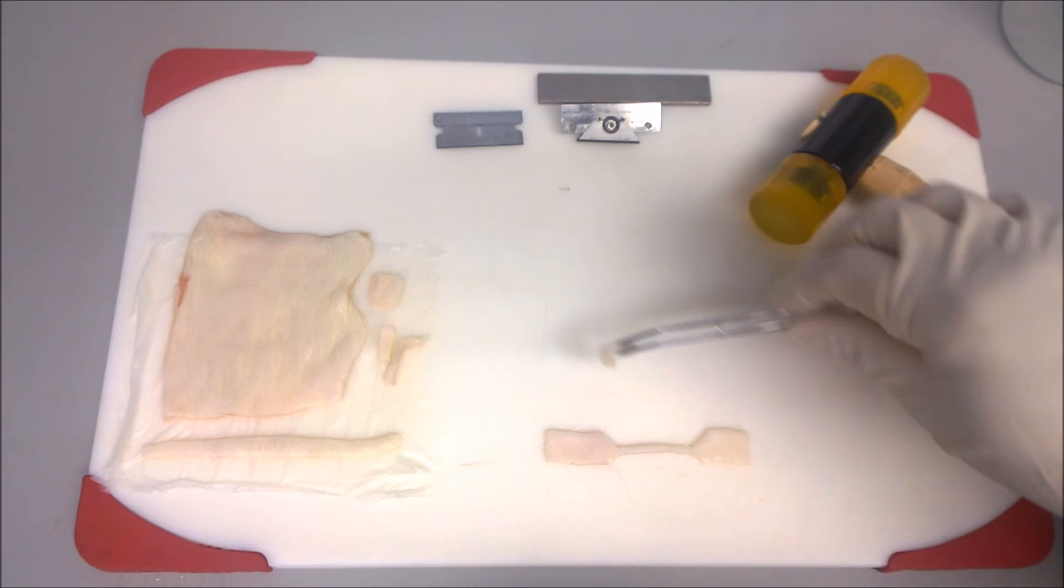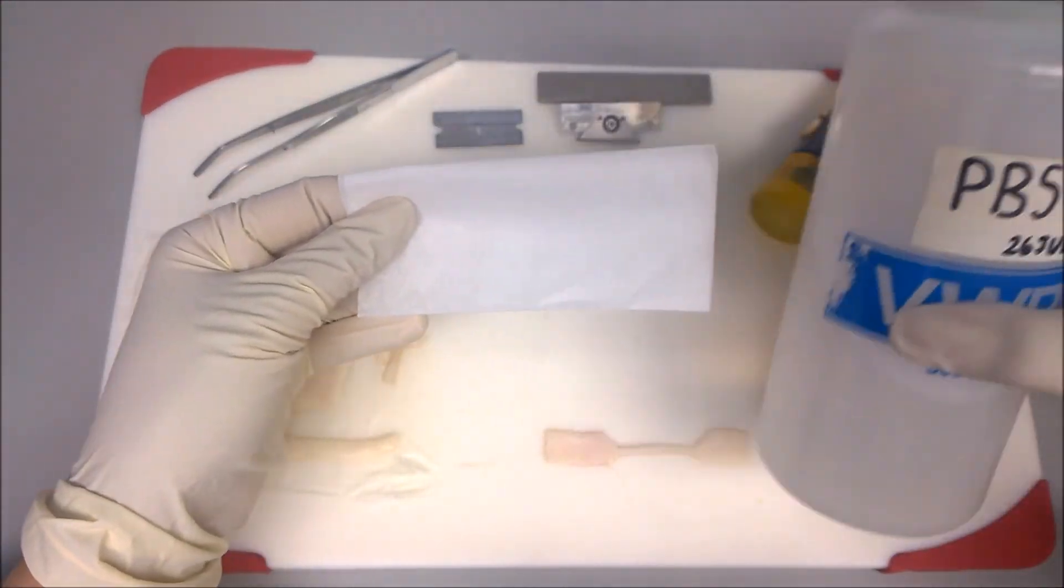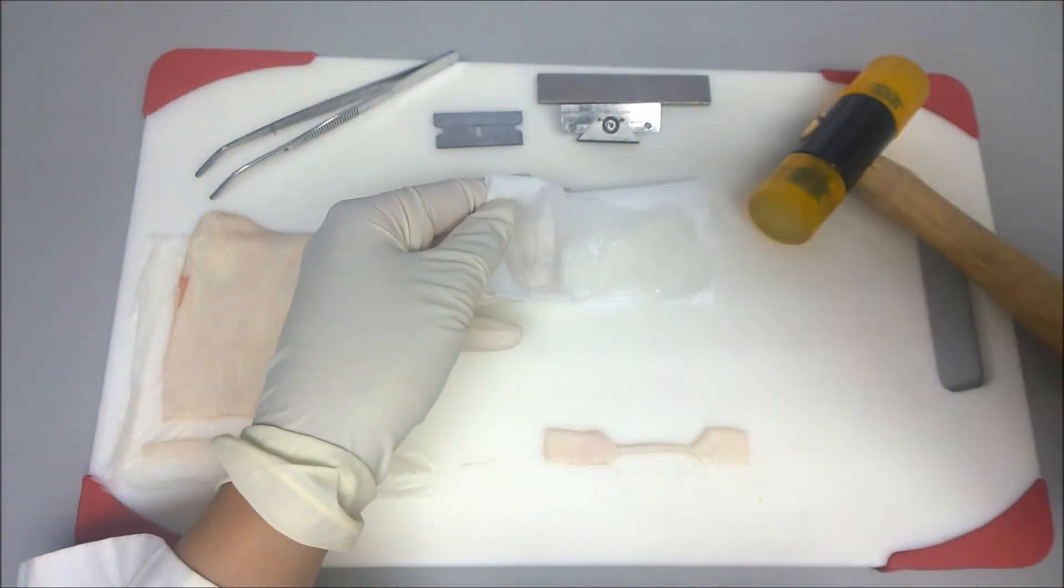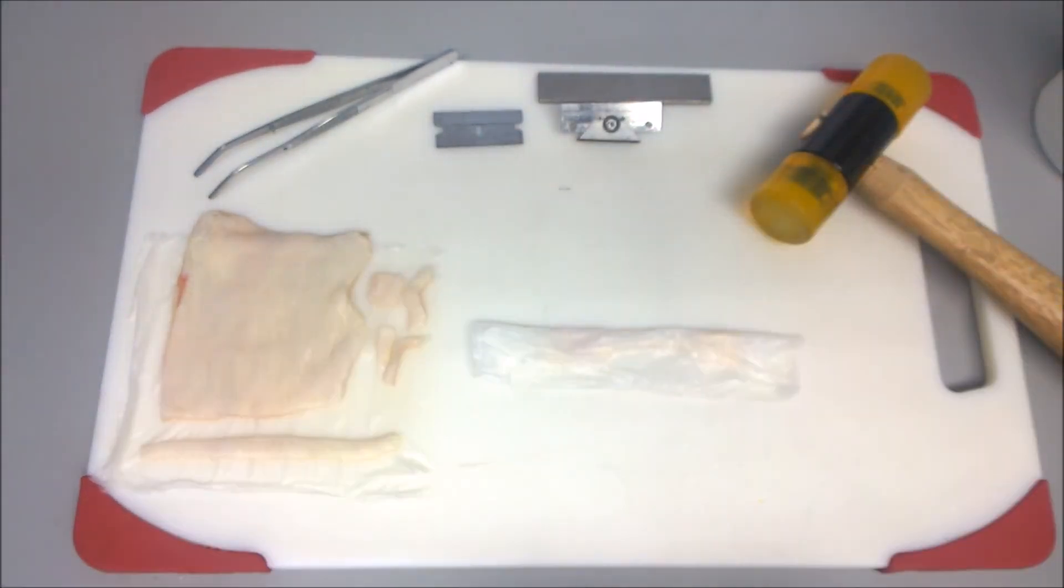Now that you have your dog bone shaped skin sample, place it in a delicate task wipe soaked in PBS to preserve the moisture until testing.